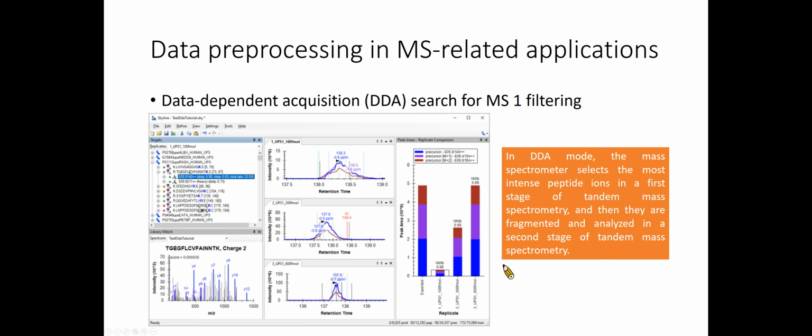In mass spectrometry, data-dependent acquisition refers to a mode of operation in which the mass spectrometer selectively collects and analyzes fragment ions from a set of precursor ions based on the intensity or quality of the signals. This type of acquisition allows the mass spectrometer to focus on the most abundant or interesting ions in the sample and reduce the amount of data that must be processed.